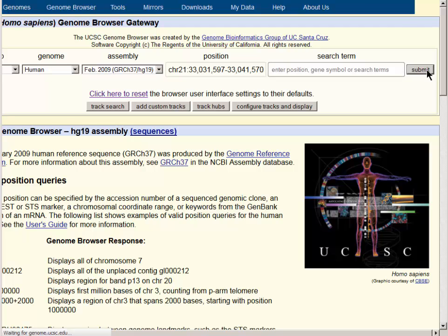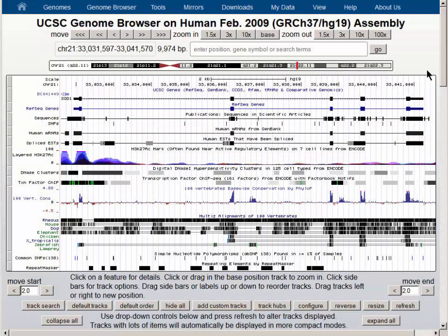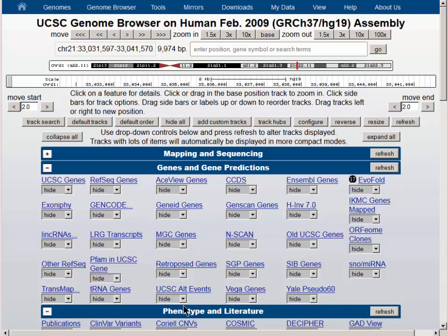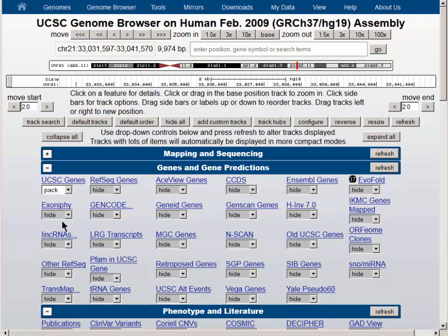The submit button takes us into the main browser viewer with a large number of data tracks turned on. The hide all button below the browser graphic allows us to turn all of these data tracks off and start with a clean page. We will turn on the UCSC Genes Track to pack, but you can see we can use other genes for this purpose as well — the RefSeq or the Gencode gene tracks.